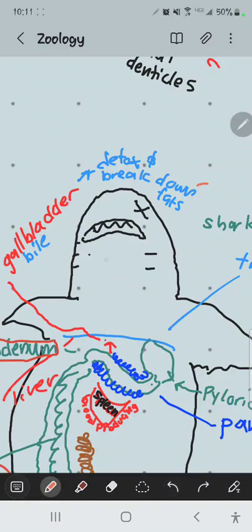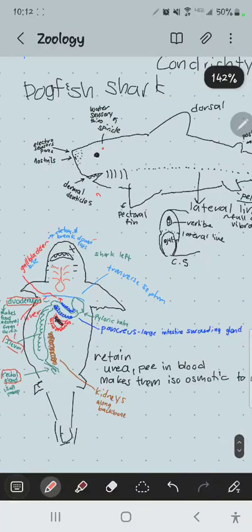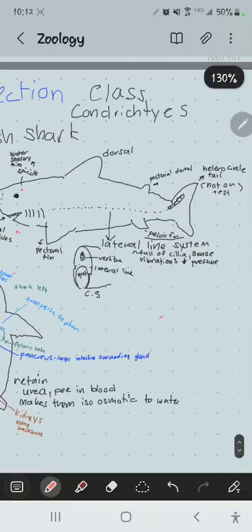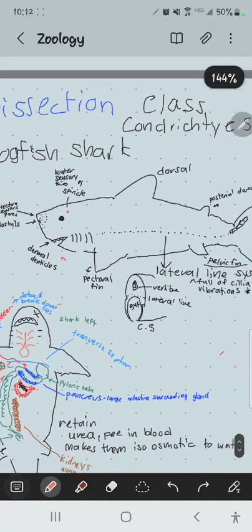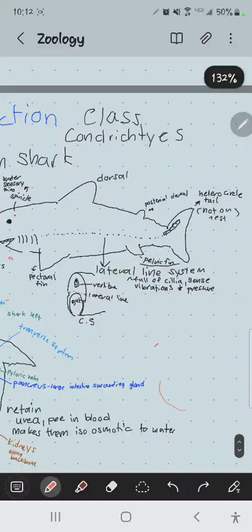So the heart is located here, and I'll go ahead and label these parts, but I want to draw a more elaborate one, because I'll probably have a station just asking you about heart structures specifically. So the ventricle, there is one ventricle, which is the major heart pump. All right, and then these are what are called afferent branches.